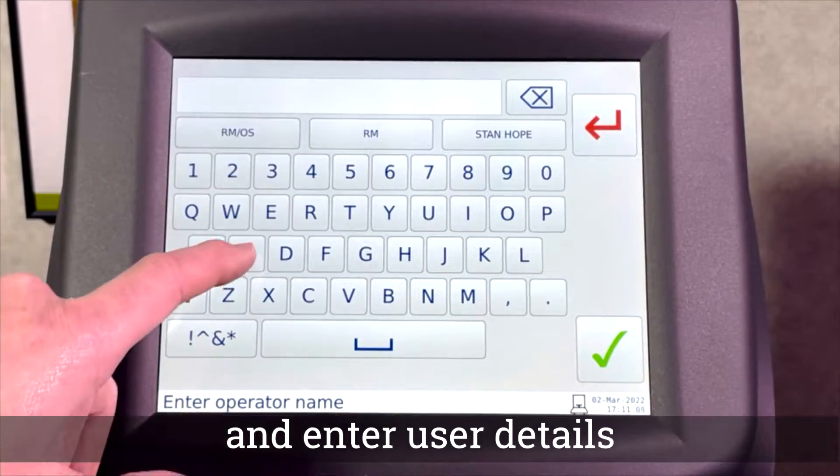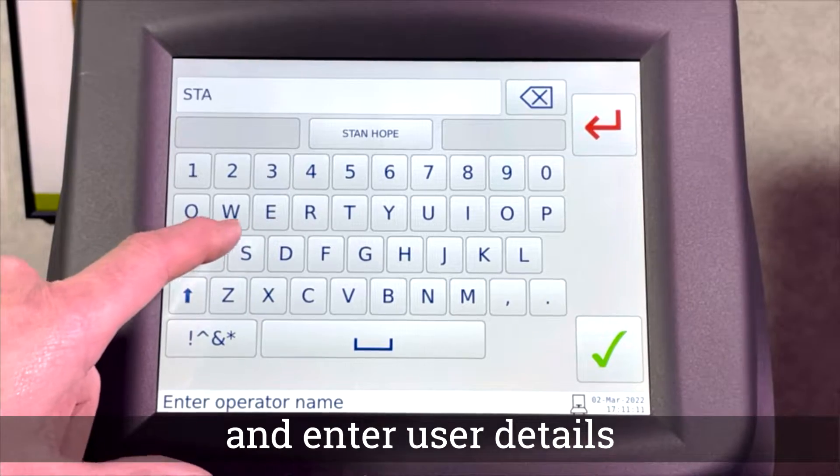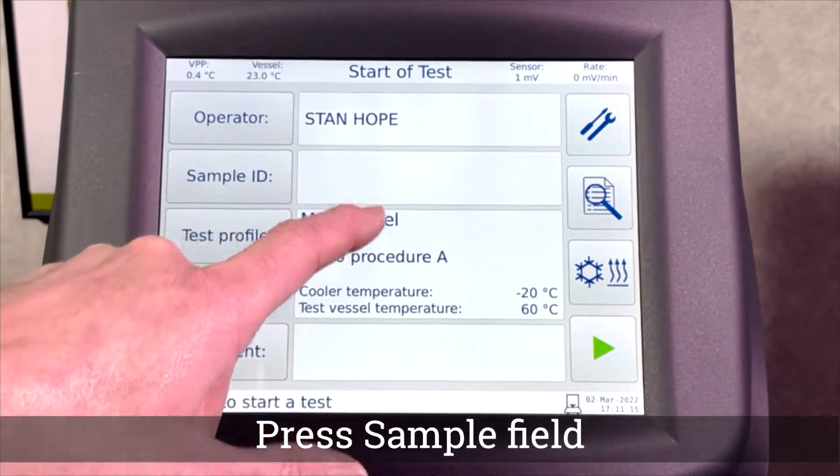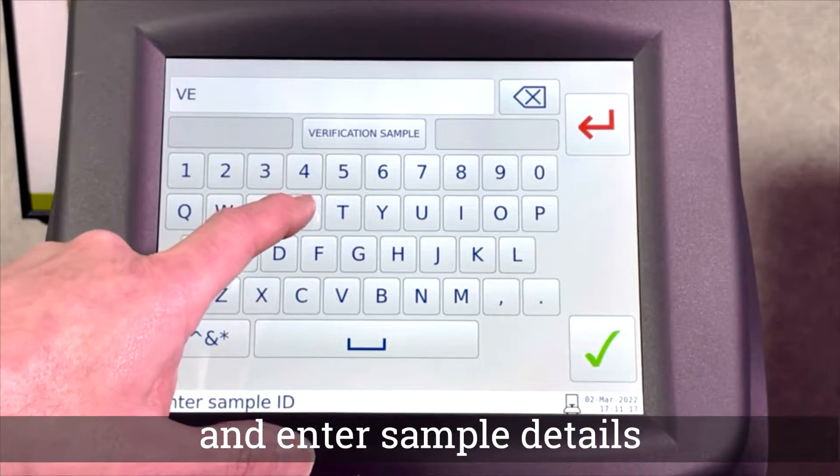To enter the operator ID, press the operator field which automatically displays a touch keypad. For the sample ID, enter the details in the same way.